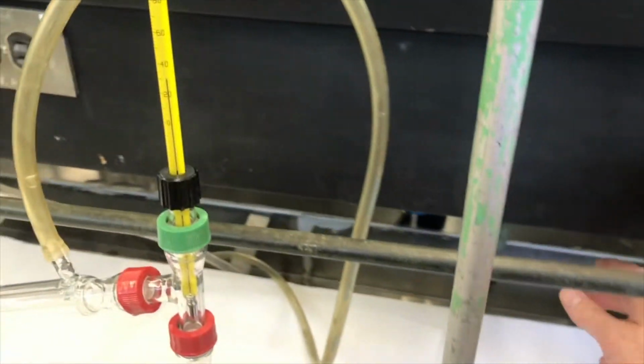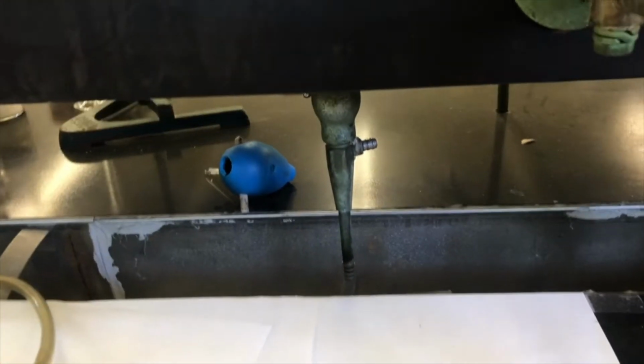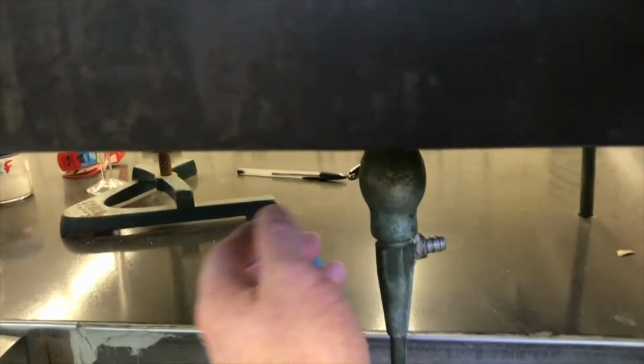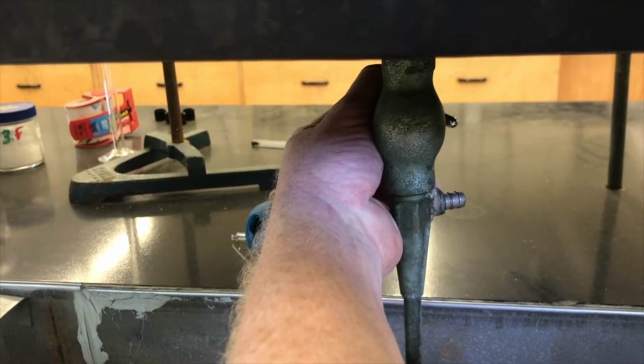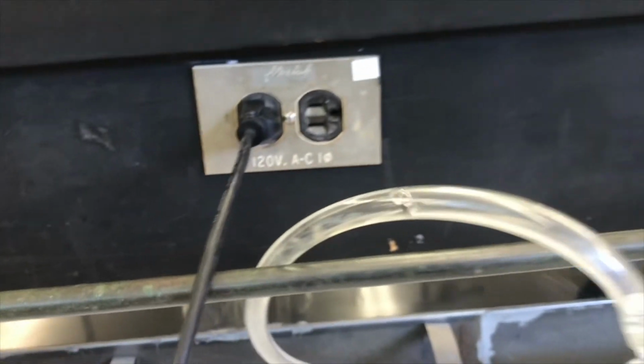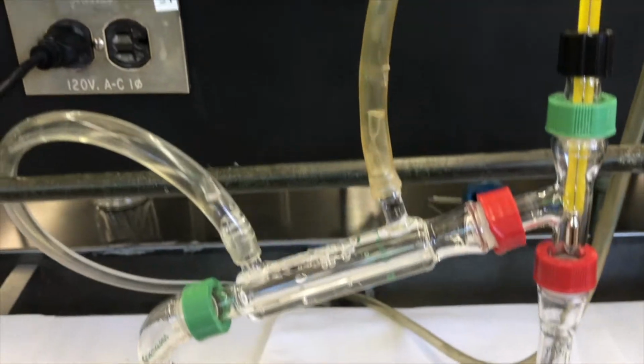When you turn the water on, we do this the opposite of a vacuum situation, where we want to draw a vacuum for vacuum filtration. When we want to do a vacuum filtration, we turn the water on full blast. For this, we want to turn the water on as minimal as possible. So I'm going to just barely turn it on, and then watch as the water comes around. You see it coming around, and then it's going to fill up and then drain out.